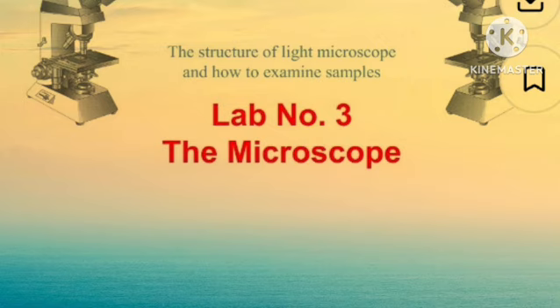So what are the microscope and microscopic terms? Magnification is very important. What is magnification? It is the scale of enlargement. Magnification is the scale of enlargement.